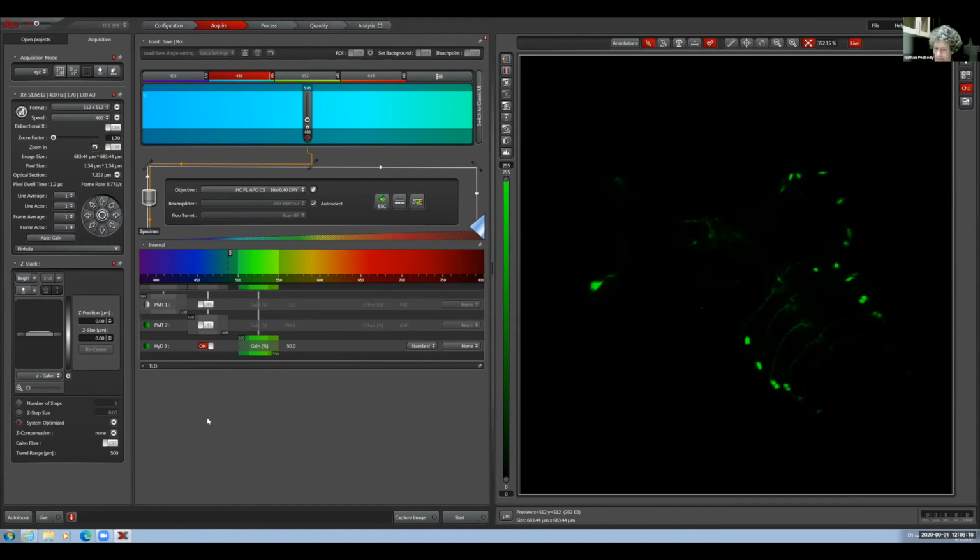Okay. And you'll see that if you zoom in on something that's sort of labeled or sort of full field of labeling, you zoom in a lot, you take a bunch of images. As soon as you start zooming out, you'll see the exact square you were imaging that can be bleached. Ooh, that's good. We have a thing called Project Bleach too, which is sort of on purpose bleach something. Mm-hmm. So that's cool. I'm like, go pick a neuron and bleach it. So then they'll take one big picture and then I'll have them use the Zoom software to go in, bleach it, then come back out and say, see? Yep. Okay, Zoom in, cool. Crank the laser up, it'll bleach pretty quick.